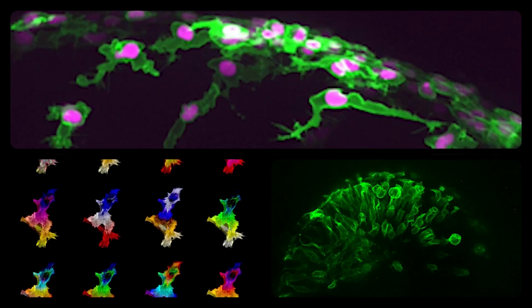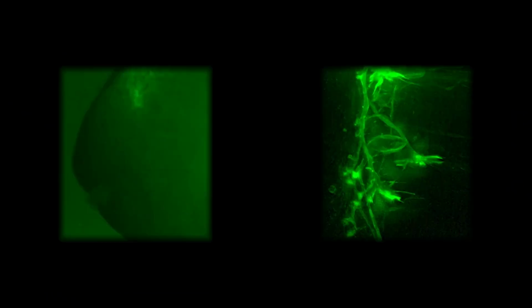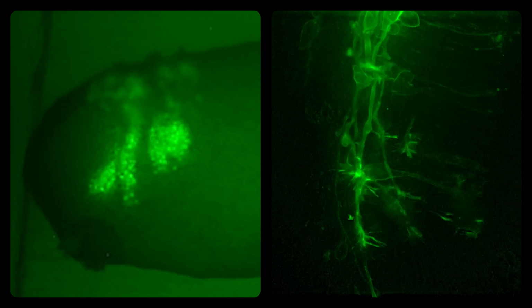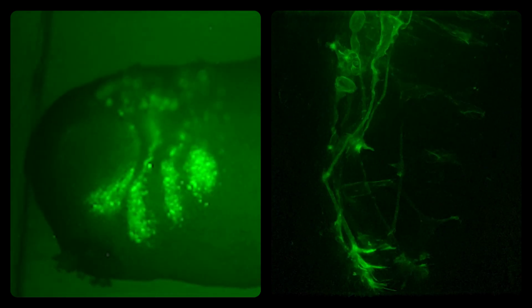In our lab, we study how neural crest cells migrate. We use the zebrafish embryo because we can film cells as they move within the embryo, and we can watch all sorts of very dynamic behaviors that the cells do. As they squeeze through the tissue, they will change shape, the nucleus will change shape, and we can really look at these in real time.